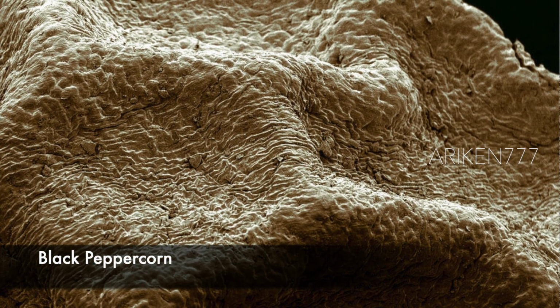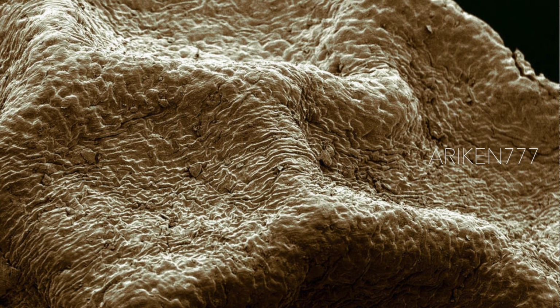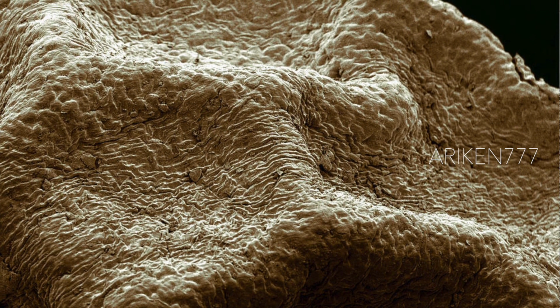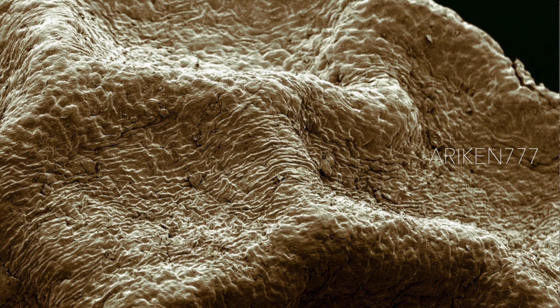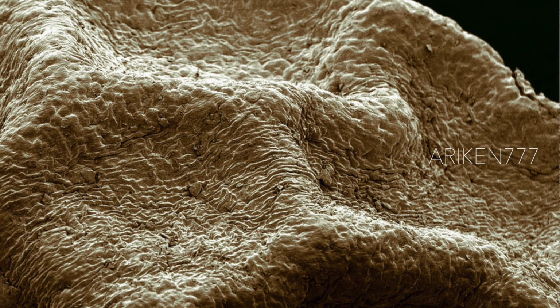The wrinkled surface of a dry black peppercorn. The bite of black and white pepper is caused by an alkaloid, piperine. The black color is the result of browning of the peppercorns caused by a fungus, Glomerella cingulata.